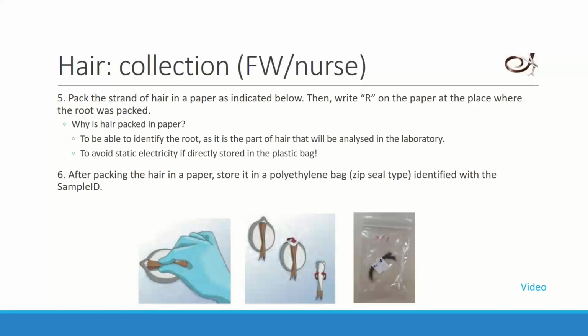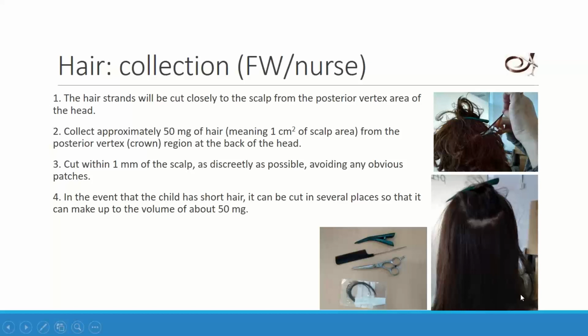Right. And the last thing, you will find a video on Google Drive explaining how to do all this, but you have to take into account that in the video, the person is cutting 1 square centimeter of hair, and we do not recommend this. We recommend cutting a straight line, okay, instead of a patch. It's the only difference, but for the rest, you can look at the video and have an idea of how it goes.